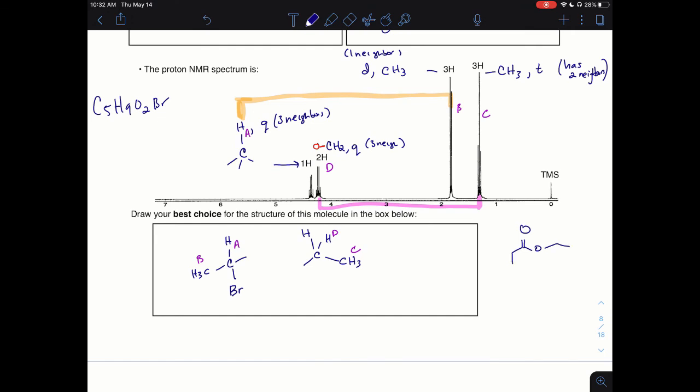We have this choice, and we have this choice. I'm trying to find the best way to do this. I'm sorry that you're having to listen to my internal monologue more today than usual. All right, there we go. So we have these 2 choices.